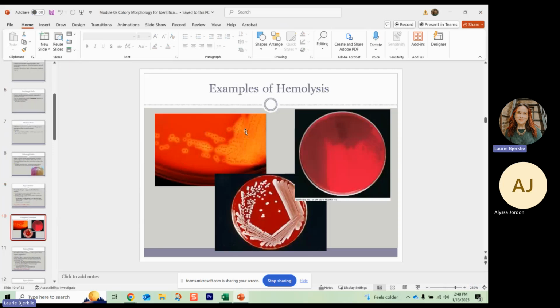And we would report that. Certain organisms always are beta hemolytic and certain organisms are not, and so that's part of determining what we have. So you would report beta hemolysis if you were to hold this up to the light and look for it and observe. This one's hard to see. It's not showing great in the lab. You'll see it at some point. I should have found a better picture here.